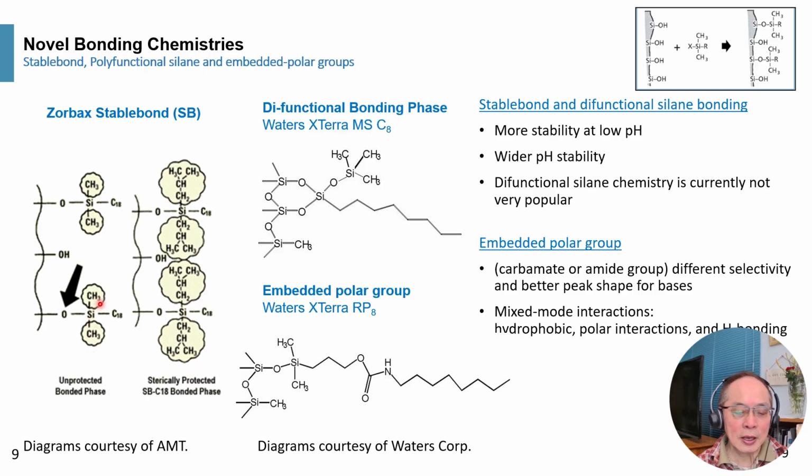such as here, the silane bonding chemistry is actually an isopropyl group, and this is designed to shield the effect of the residual silanol group on that, right? So to make it bulky on the side, so that the analyte is less able to access the residual silanol group. Typically, for StableBond, we do not do any end capping.